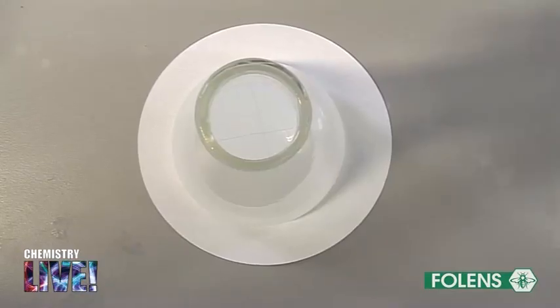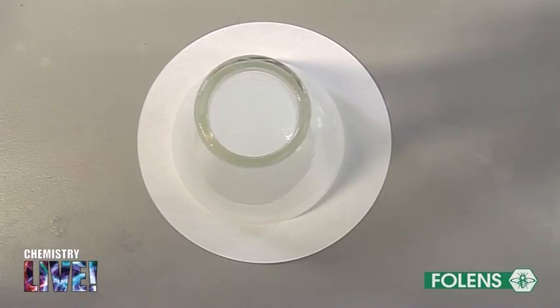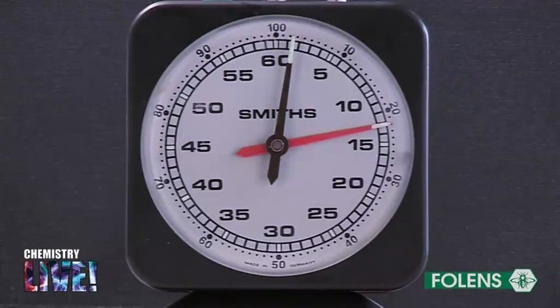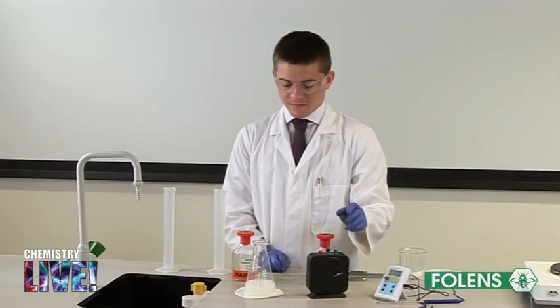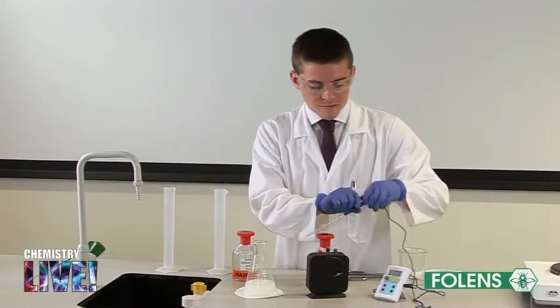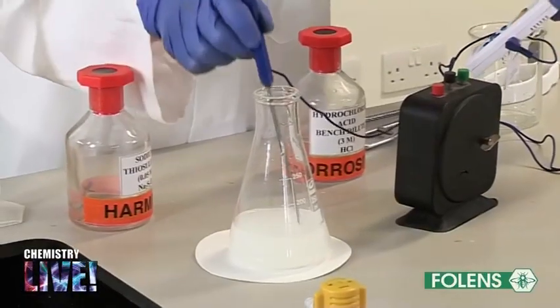Look at the cross through the solution and when the degree of milkiness reaches such a stage that the cross is no longer visible, stop the stop clock. Note the time taken in seconds and measure the temperature of the solution as some cooling may have taken place when the two solutions are mixed.